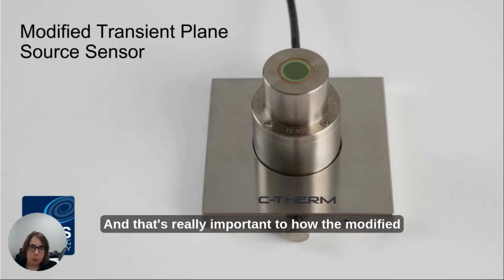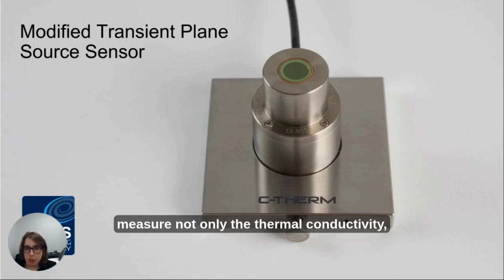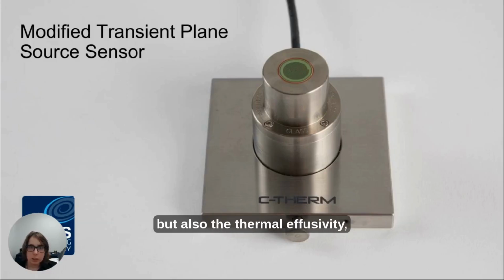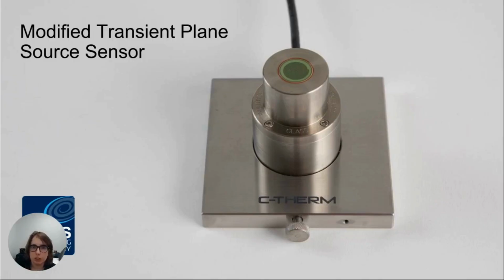And that's really important to how the modified transient plane source method works and how it can measure not only the thermal conductivity, but also the thermal effusivity, which can be important in terms of evaluating the efficiency of one-dimensional heat transfer, because it dictates the interfacial temperature between two bodies.